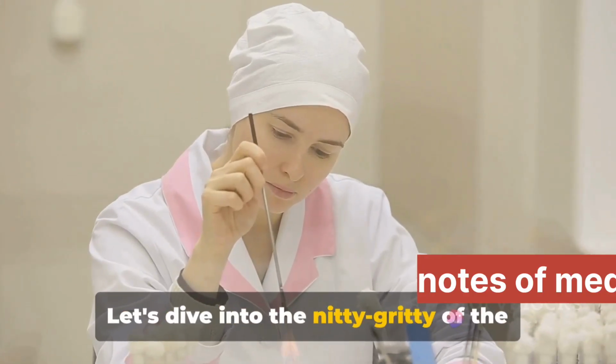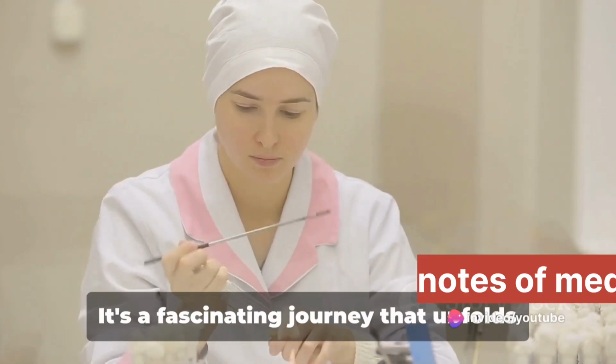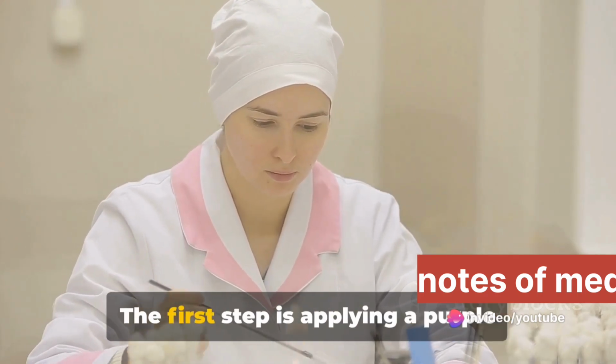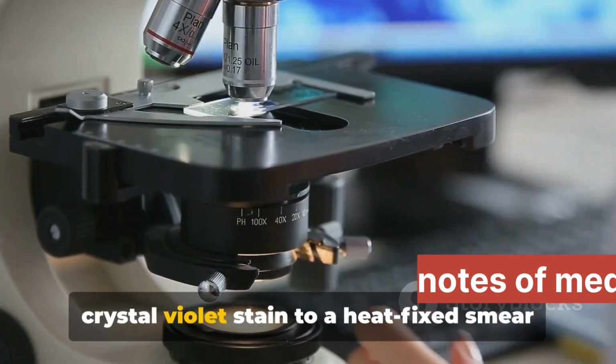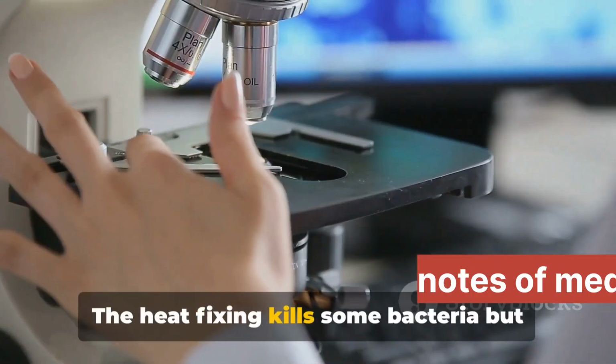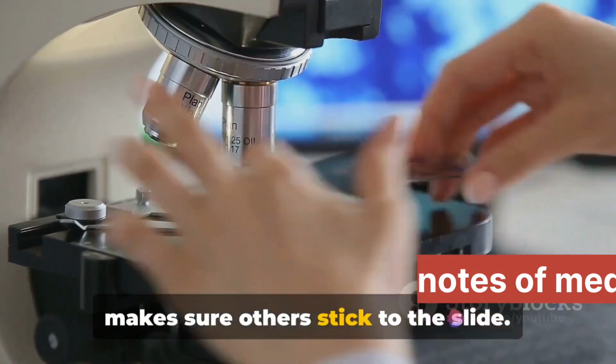Let's dive into the nitty-gritty of the Gram staining process. It's a fascinating journey that unfolds in 4 primary stages. The first step is applying a purple crystal violet stain to a heat-fixed smear of bacterial culture. The heat fixing kills some bacteria but makes sure others stick to the slide.